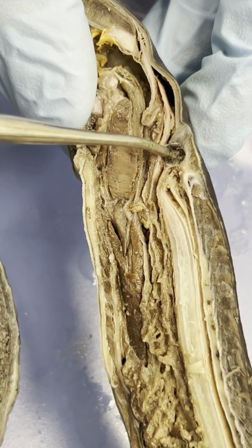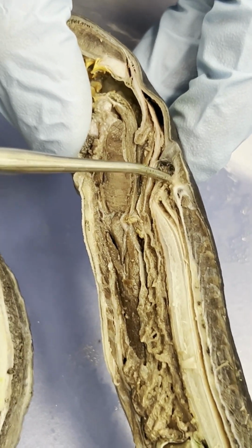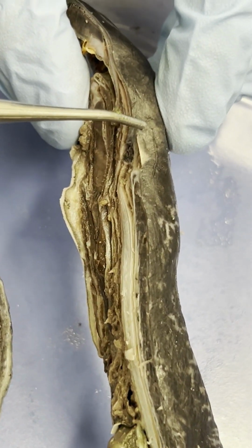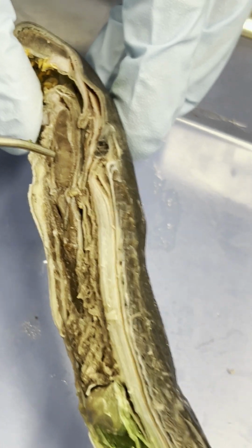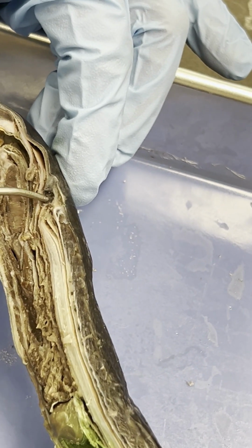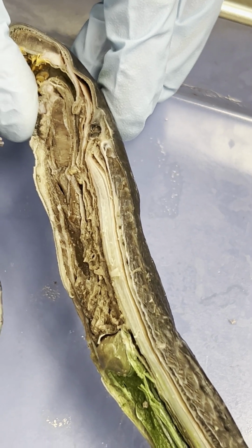This is the olfactory bulb. You guys look up what is the function of the olfactory bulb. Keep in mind, the olfactory bulb is attached to the nostril or the nasohypophyseal opening. Say it again out loud to yourself. It's a long word, probably a new word for you guys, okay? But we have all these things right here: the olfactory bulb, the pineal gland, and also the brain, which is attached to the spinal cord, okay?